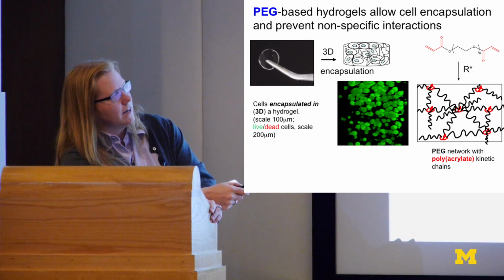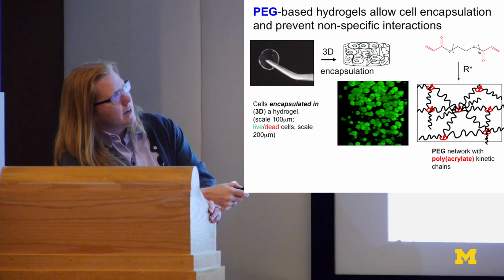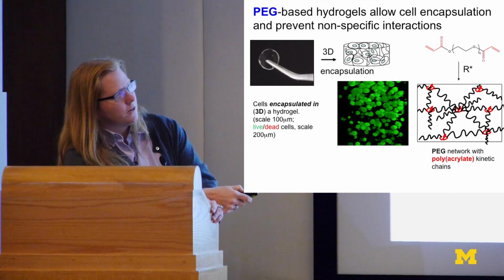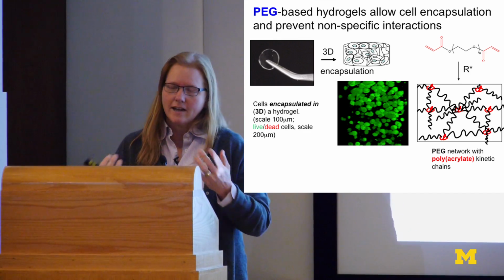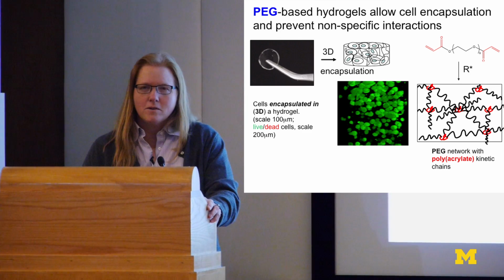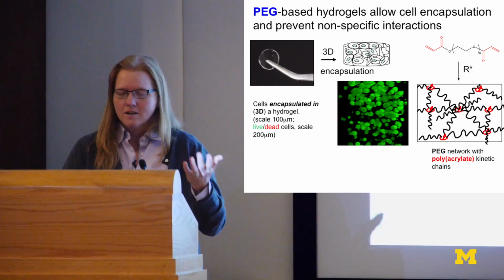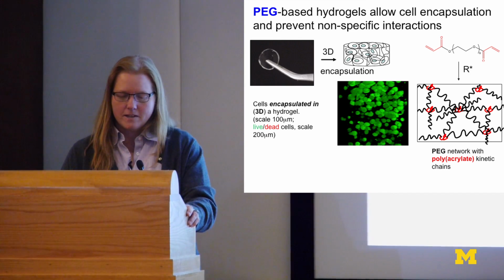Here's just an acrylate that when you dissolve this in the presence of cells and undergo a polymerization reaction, these end groups will link up and you'll create cross-linked hydrogel structures in situ, encapsulating cells. Now, I want to give a little bit of motivation to tell you why some of these just simple material structures are really useful for understanding matrix signaling and with cells.